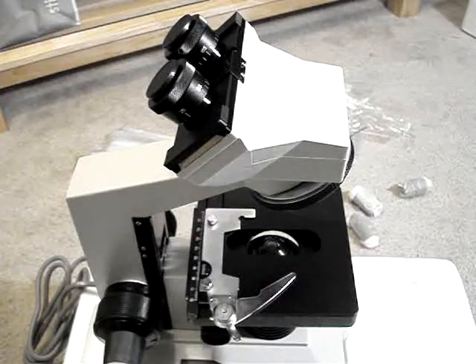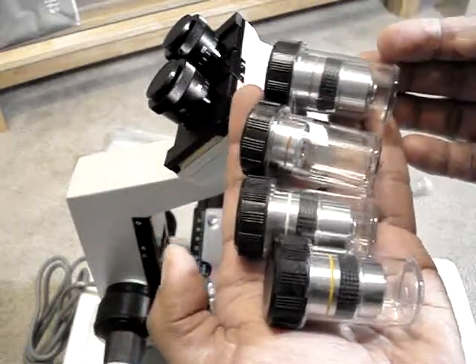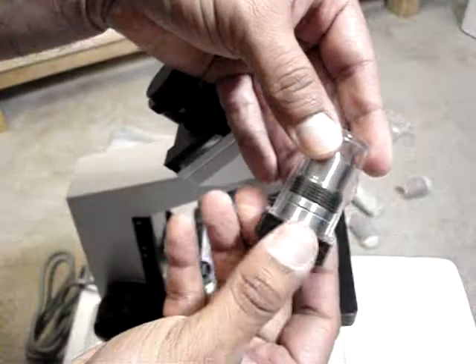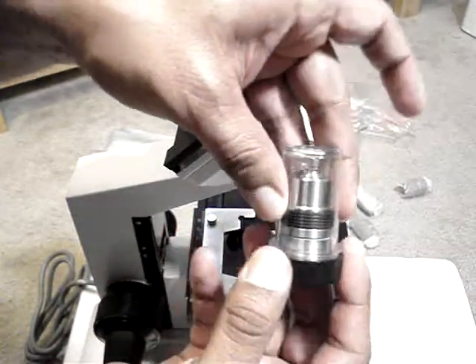One of the things that I was very impressed with on this particular microscope is the objective lenses are very well put together. Actually, the entire microscope is very well put together.